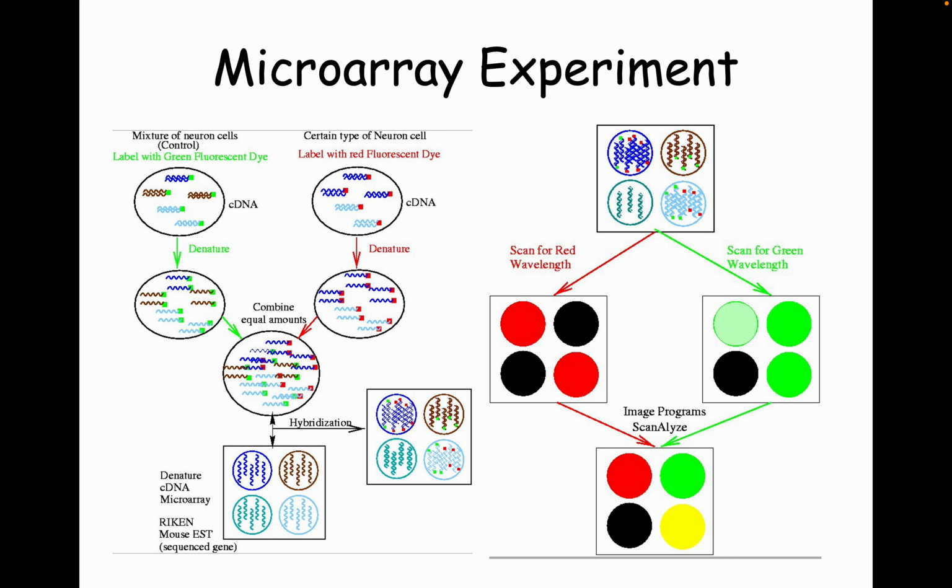And then if you want to see what a protein binds to, you can put all these different DNAs and lay them all out. You can actually have every possible combination, maybe, of DNA sequence on there, at least of a short sequence. And you can put your protein over and you can see, okay, where does the protein bind? If you're able to label the protein with some sort of color, or label the DNA in a way that the protein will block the light from that, then you can just basically take a picture of it and you can then interpret that.